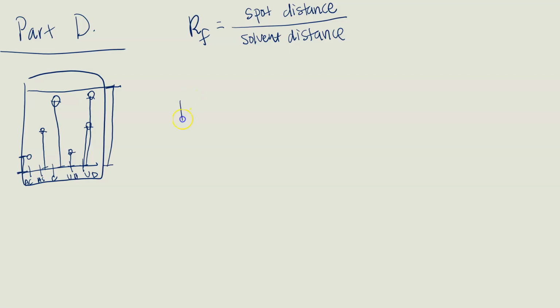Okay, so I'm going to pretend the RF value for acetaminophen, when I did my math, was 0.17. And then I did the RF value for unknown B, which to me looks like they're about the same, and I got 0.19. So the RF value for acetaminophen and the RF value for unknown B are very, very similar. That's evidence that I think unknown B is acetaminophen. And then you're going to be able to do this for all of the other ones. So this is our evidence.